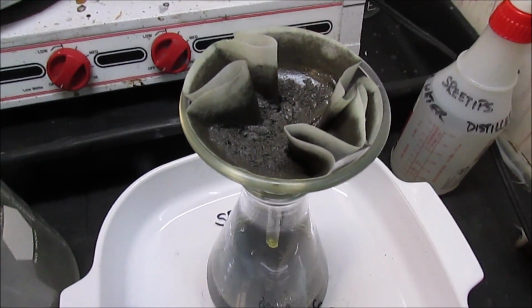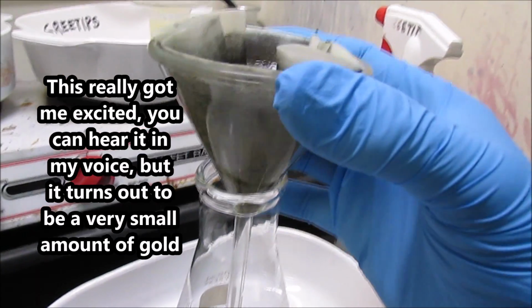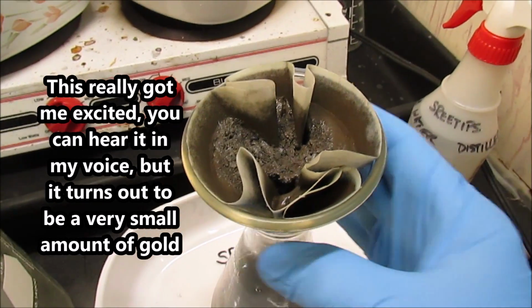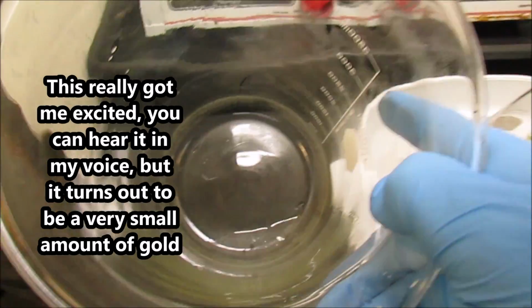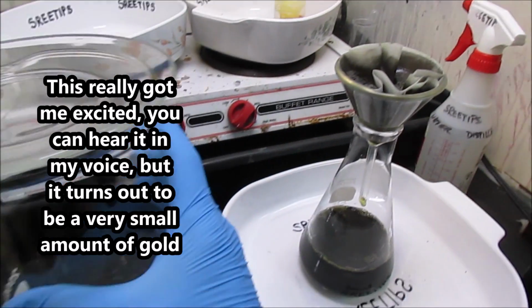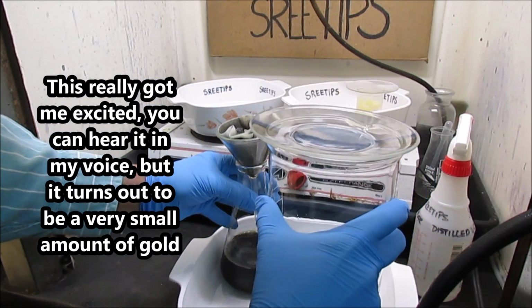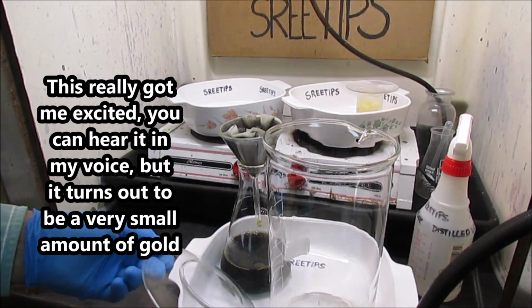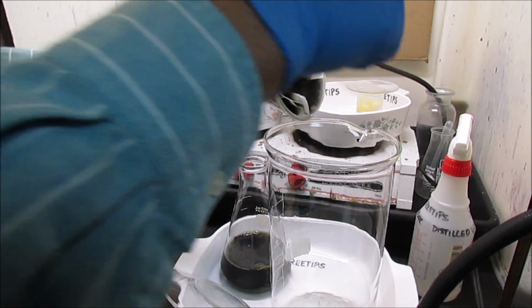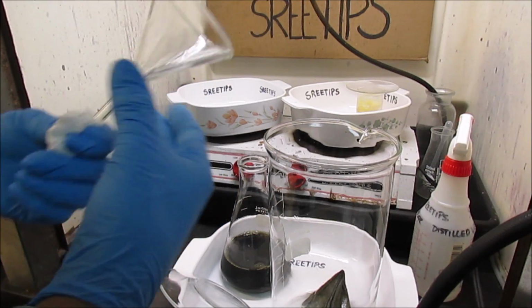Got everything into the filter now. Man, I cannot believe how much material precipitated out there. I don't know if that's all going to be gold. It's all out of the beaker. Move this beaker out of the way. I've got a clean 2-liter beaker here. I'll get this stuff in the beaker now. Lot of stuff, man. I don't know what that's going to be.